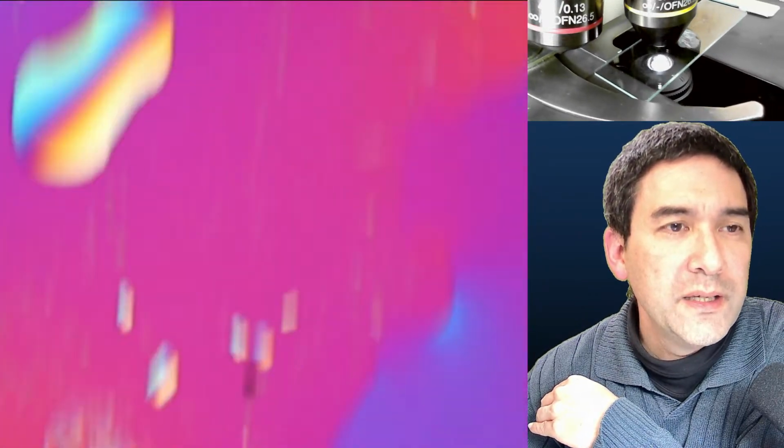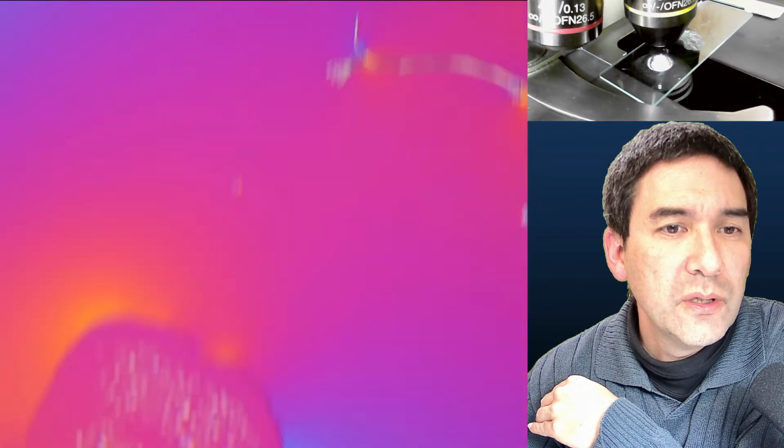So what I'm going to try now is I'm going to simply leave it here. So I'm right in the middle, and I'm going to take, I would say, maybe one of those tips that I have here. Number 5. Where is it? Citric acid. So that's it. Over here.